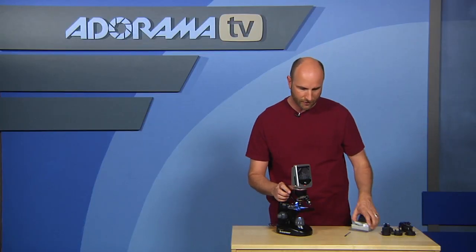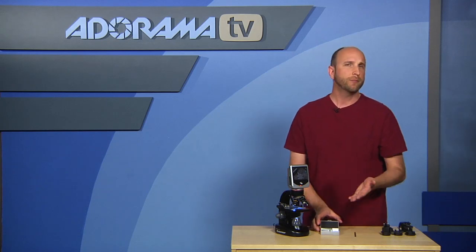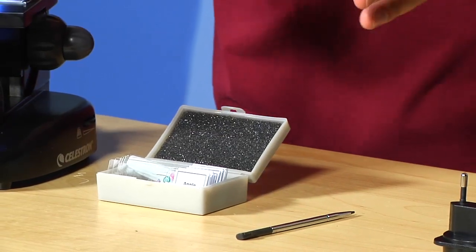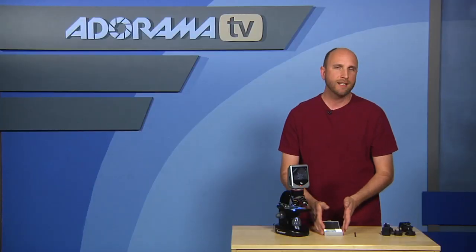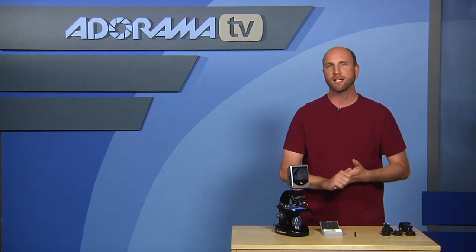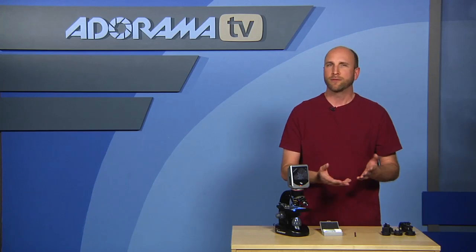In addition to the wood pine slide I have in there, the kit comes with seven pieces including a bunch of prepared slides. If you don't know how to prepare slides and you're just curious, they come right in the box. You can also buy additional slides of all kinds of things, or order blank slides and make your own — put whatever you want in there.